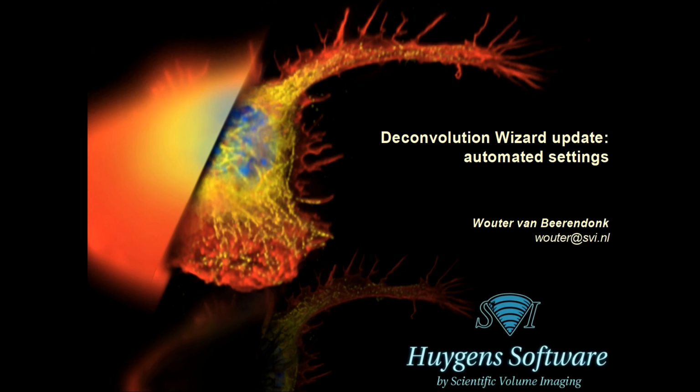Today I will show you some of the changes we made in the Deconvolution Wizard. The biggest change is that we added a new parameter for the regularization of the deconvolution result. This parameter was already incorporated in the Deconvolution Express tool to do fully automated deconvolution without any interaction with the user. From now on it will also be possible to get identical results with the Deconvolution Wizard while still being able to change parameters if you would like to do so.